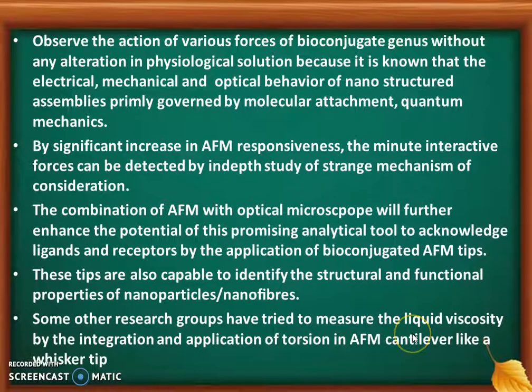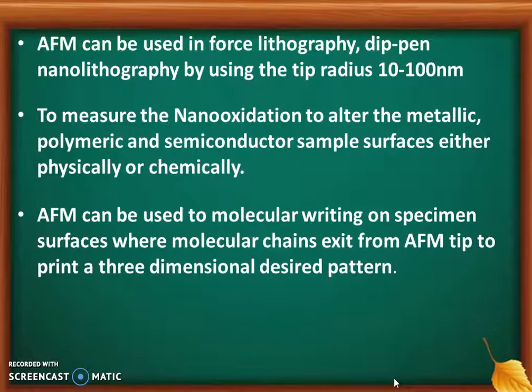These tips are also capable of identifying the structural and functional properties of nanoparticles and nanofibers. Some other research groups have tried to measure liquid viscosity by integrating a torsion rod or torsion mechanism in the AFM cantilever, like a whisker tip.